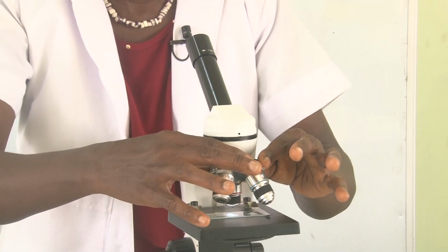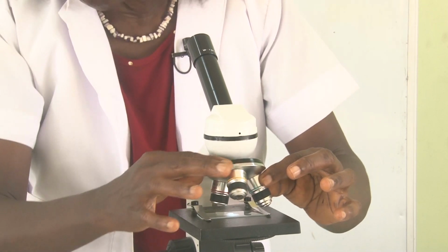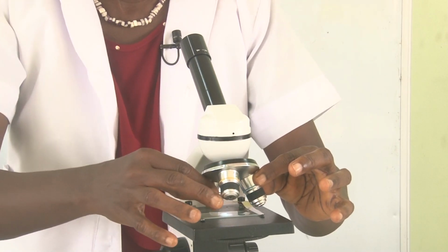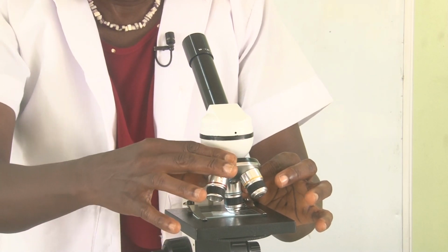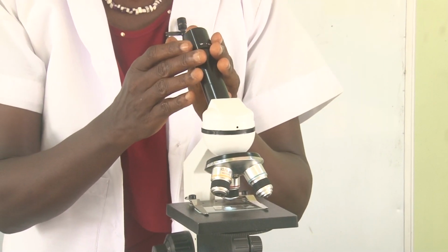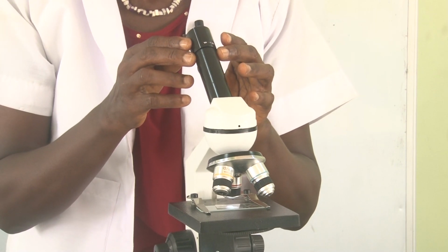We have the revolving nose piece that moves the objectives, changing from one objective power to another. That's the revolving nose piece. Then we have the eyepiece, also a convex lens that magnifies the image.